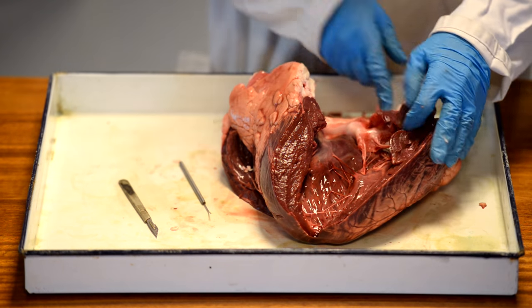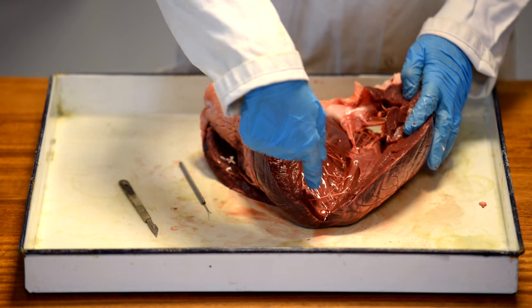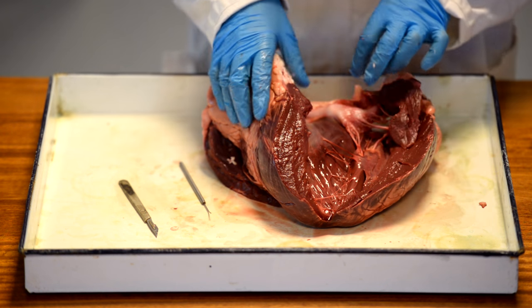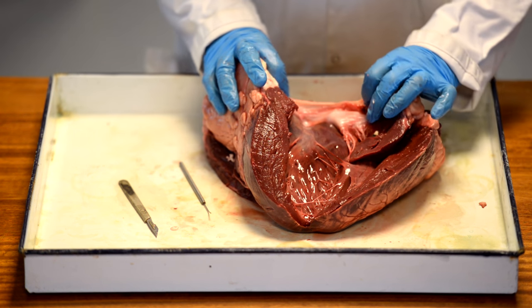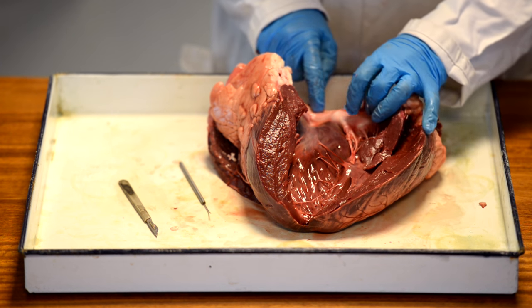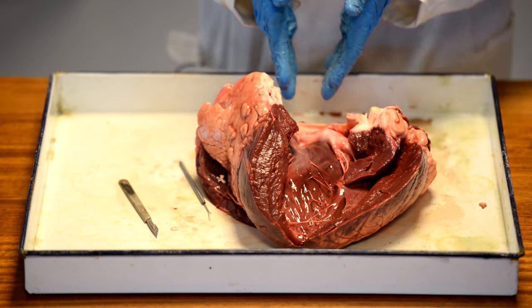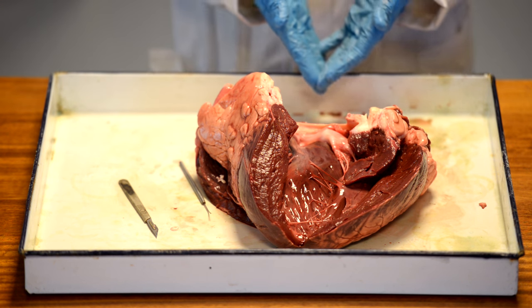So laid open for us now, you have the entire cavity of the left ventricle. You have the valve with the tissue to prevent the valve going the wrong way. And you have the funnel that will bring the blood into the aorta. And I've cut through the aorta and these are the valves, the half moon, the semilunar valves that will prevent the blood flowing back the wrong way. And the blood then is pumped up from the ventricle, up through the aorta and to the whole of the body of the animal.